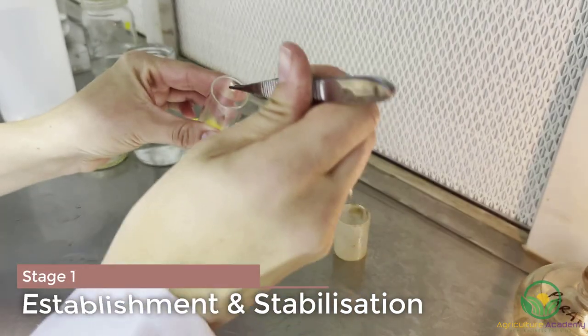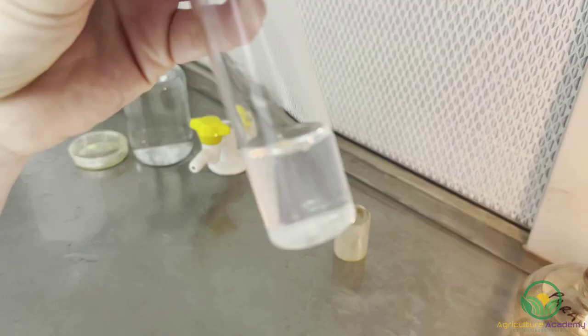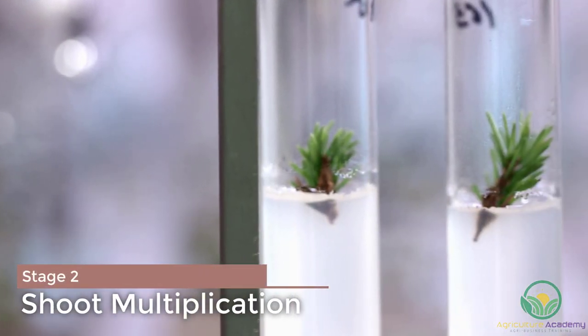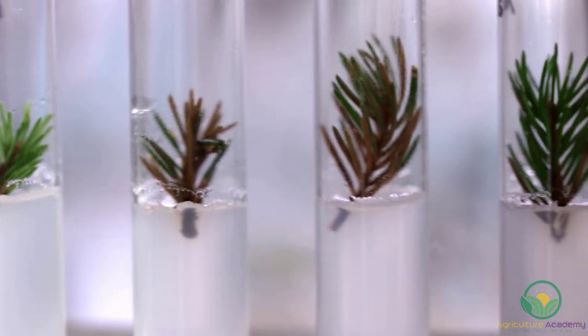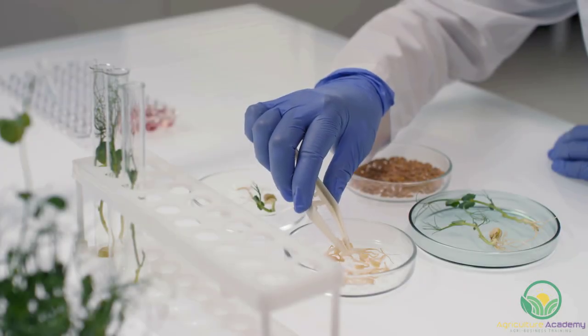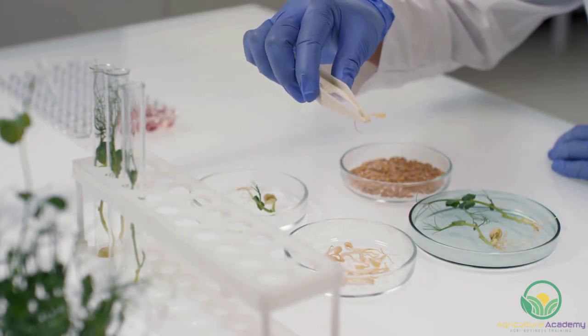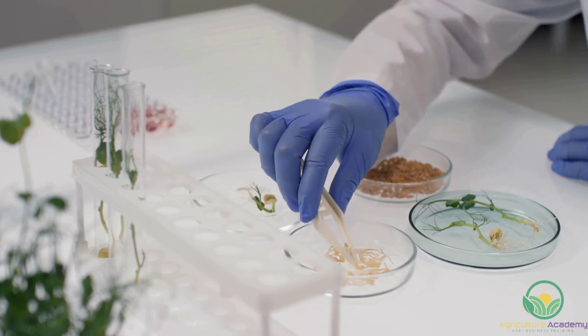In stage 1, an explant is successfully placed into an aseptic culture while avoiding contamination to provide an in vitro environment. In stage 2, the culture is maintained in a stabilized state to multiply micro shoots to the number required for rooting to begin. The explants from stage 1 are cut apart and recultured into a new medium, which will generally have a much higher cytokinin concentration and a lower auxin concentration for auxiliary and adventitious shoot growth.